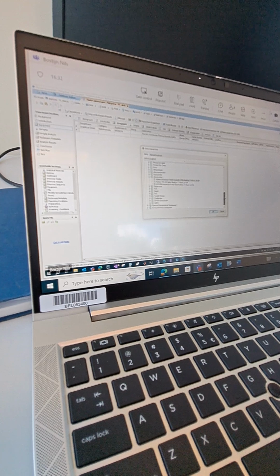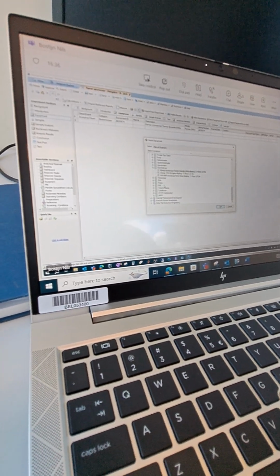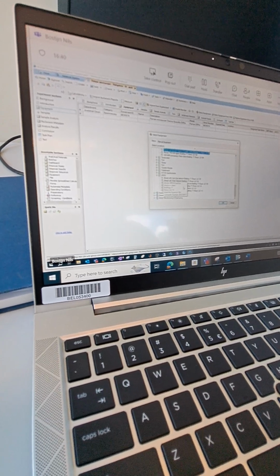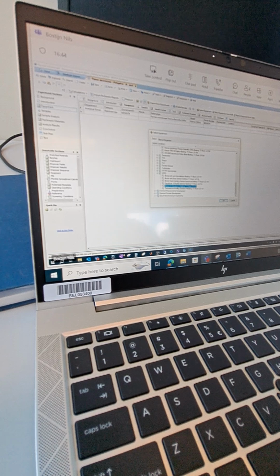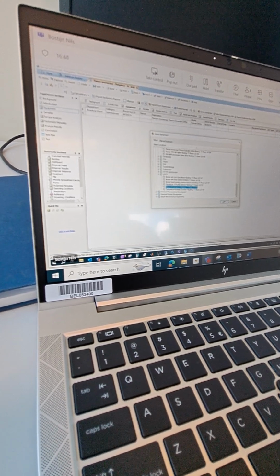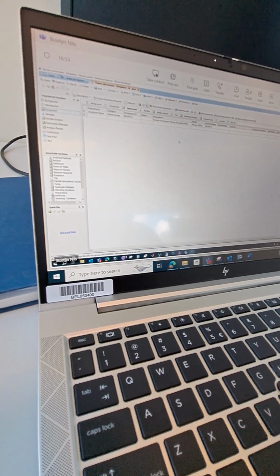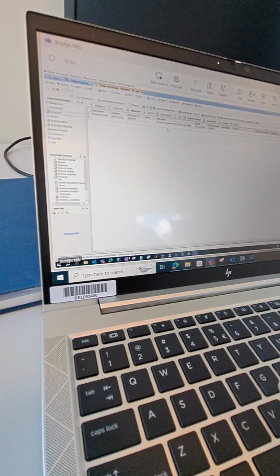So if you would need the XRPD, you have here a whole list. You can expand the XRPD and you can say, I'm using the Bruker D8 Advanced. We have multiple XRPD, and then you click on it and it will appear as a line here, or the Raman RxN2. Or the inform. I'm not sure if the inform will be here, but you can have a look.